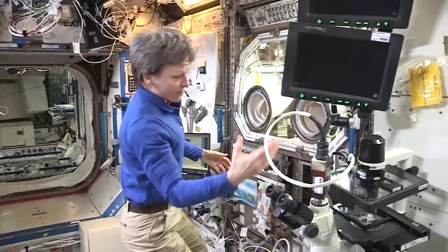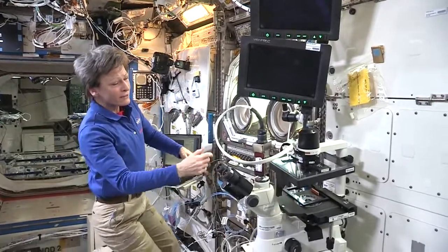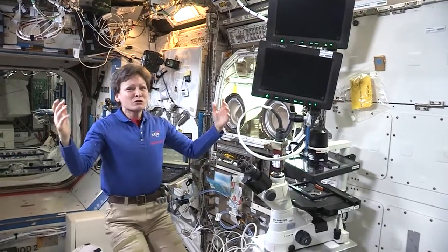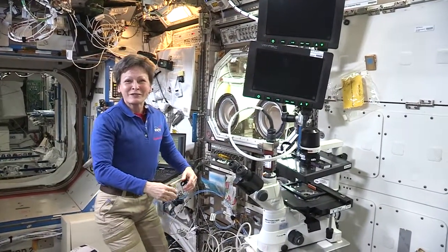The other thing that goes along with this, or is attached to this, is a microscope. We have a fantastic microscope with capability to send the videos and pictures down to the ground. Some of the ground team has been looking at the structures that are forming differently here in zero gravity — that's why they're doing the research here, to see what new they can discover. Very cool science, very cool piece of hardware — the Microgravity Sciences Glove Box.